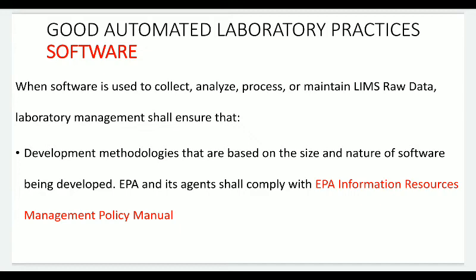But during the purchase, the laboratory management has to ensure that they develop methodologies on how to operate this software, and these methodologies are mainly made based on the size and nature of the software. So only the laboratory management is responsible for the selection of proper software, and they have to understand the size and nature of the software.